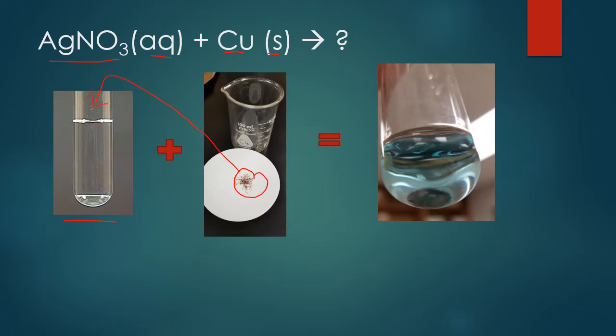And notice on the product side, off to the right, what we see. So record any observations. Did a reaction happen? Well, I definitely see a color change. And then notice the solid at the bottom, it's no longer coppery colored.